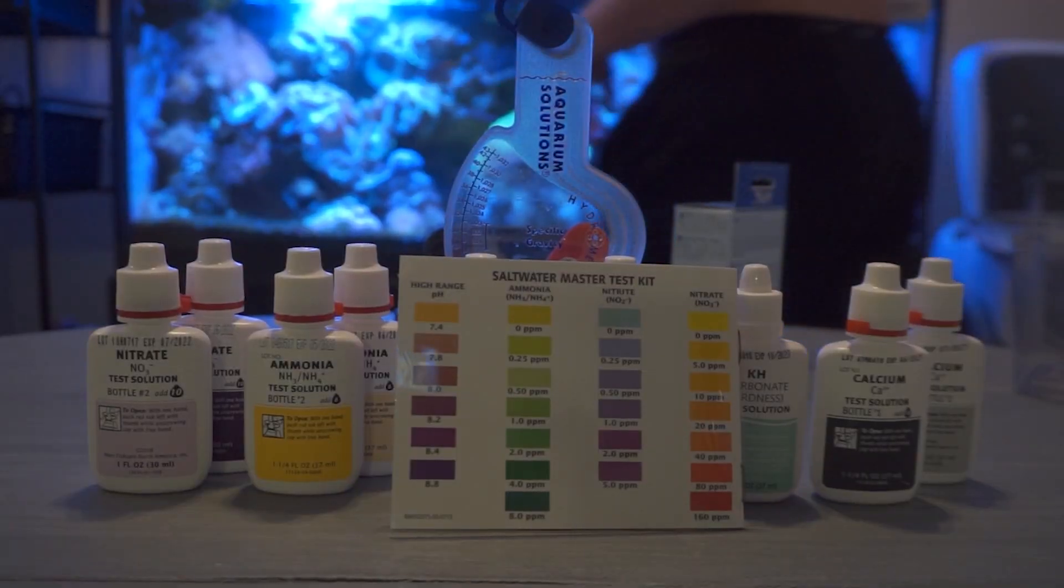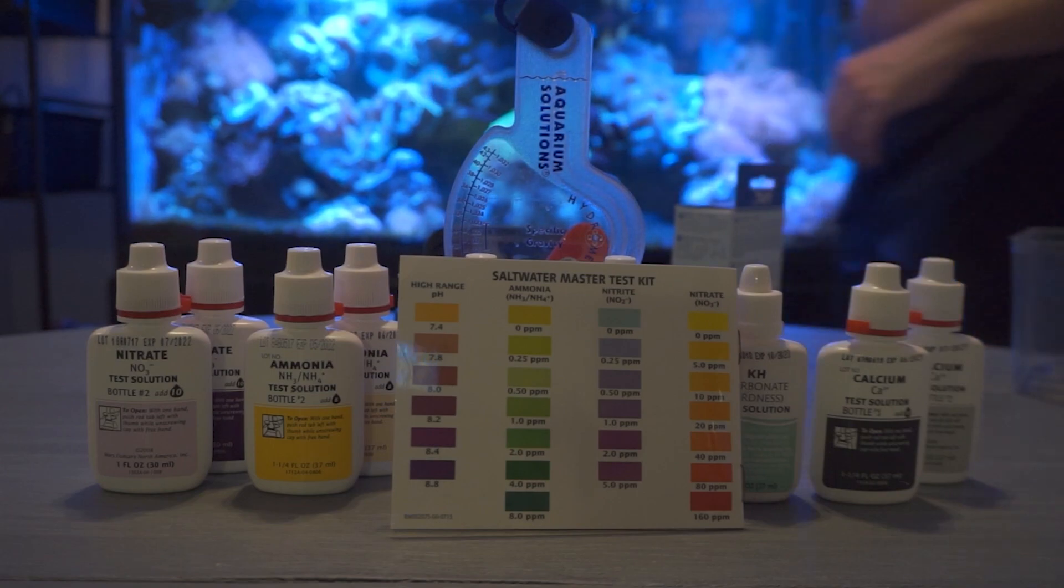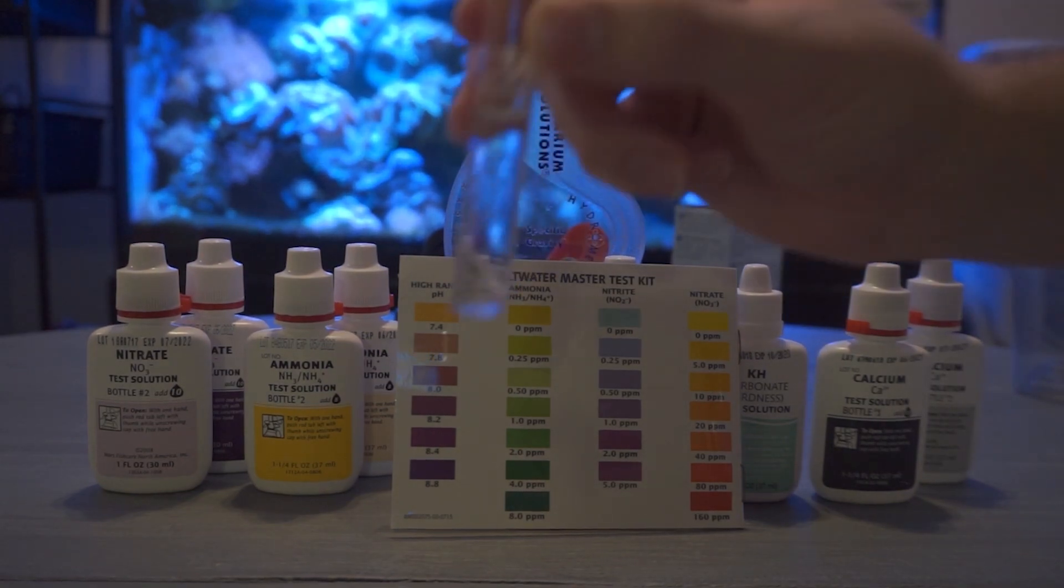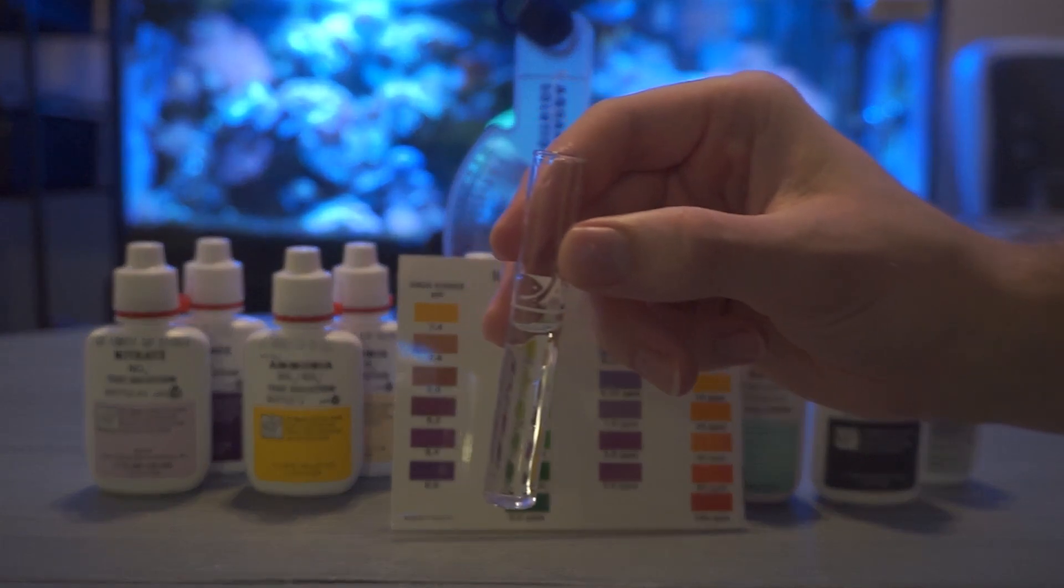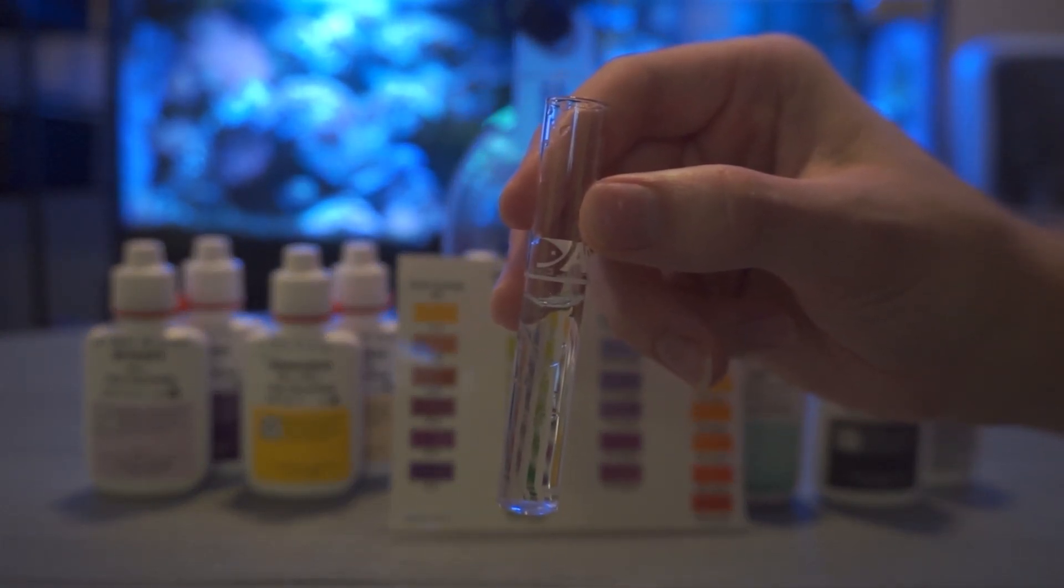So first up we're just going to get a sample of water straight from the tank. Usually I'll just put the test tube in the water if I know it's clean. If not I'll usually scoop out some water into a bowl and then I can put the water into the test tube. Now what's nice about these API test tubes is they have a nice little line right in the middle of them. They'll tell you how high to fill the water up to.